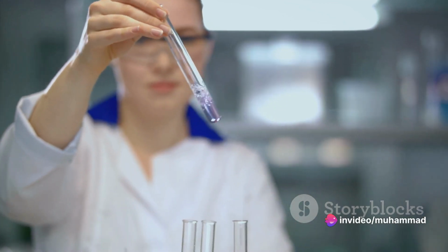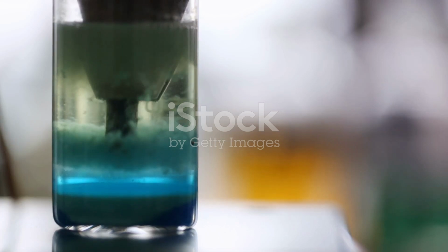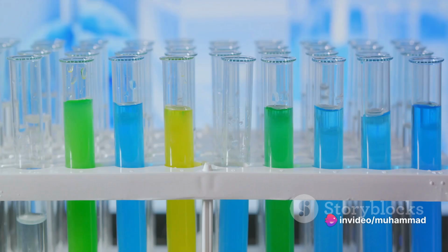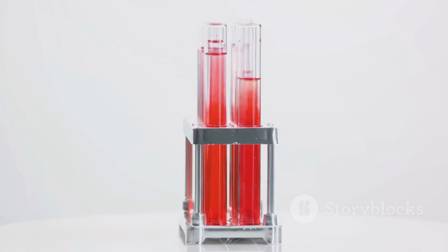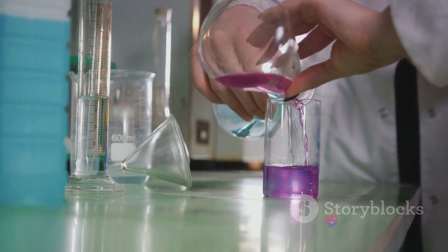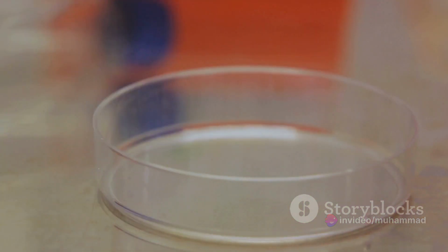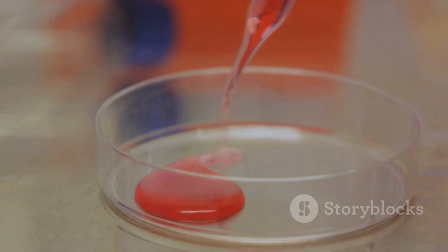Next up, we have paper chromatography. This technique is quite straightforward and, as you might guess, involves a piece of paper. More specifically, it uses a strip of absorbent paper, such as filter paper, as the stationary phase. The mobile phase, a liquid solvent, travels up the paper by capillary action. As it moves, it carries along the mixture of substances to be separated. Different substances will travel at different rates depending on their solubility in the solvent, allowing for their separation on the paper strip.